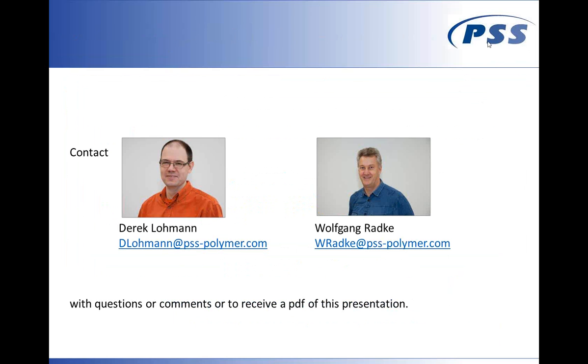Thank you. Then I have two questions regarding liquid chromatography under critical conditions, which I would like to try to combine. Question number one is, how do we make the chain invisible? And number two is where it is. They keep popping up so fast, I have to apologize. Well, let's start with that, and I'll get to the other one.